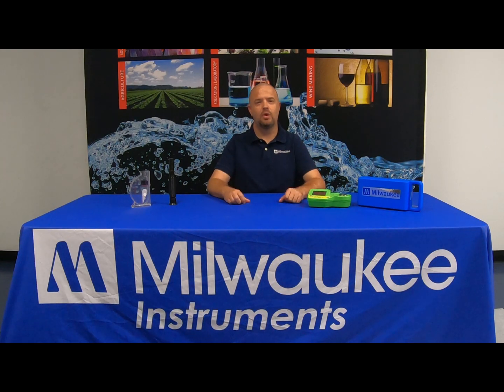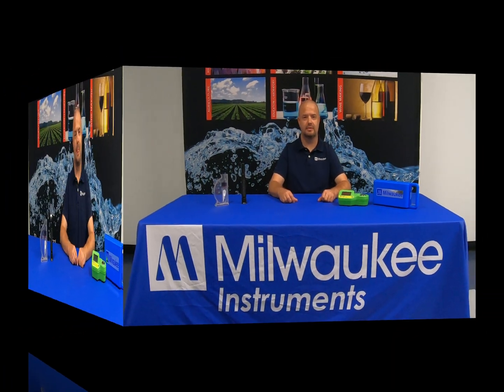In today's video, we'll be going over the Milwaukee Instruments MA-887 digital seawater refractometer. I want to show you the calibration procedure and we're also going to compare it with other units in measuring salinity. The MA-887 features three forms of display: practical salinity unit, parts per thousand, and specific gravity. It also features automatic temperature compensation.